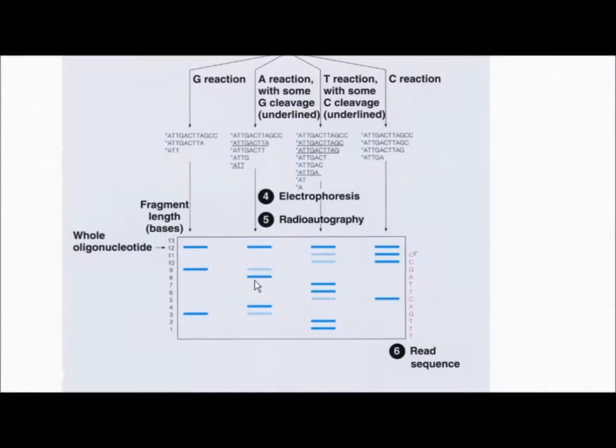So here you're going to have another fragment, another fragment, another fragment, and same thing, you have a lot of break here, depending upon the different kinds of fragments you have. And so what happens now is, when you look at these fragments, you could potentially have on this side... So for example, what you have here is an A, and that's the smallest fragment.